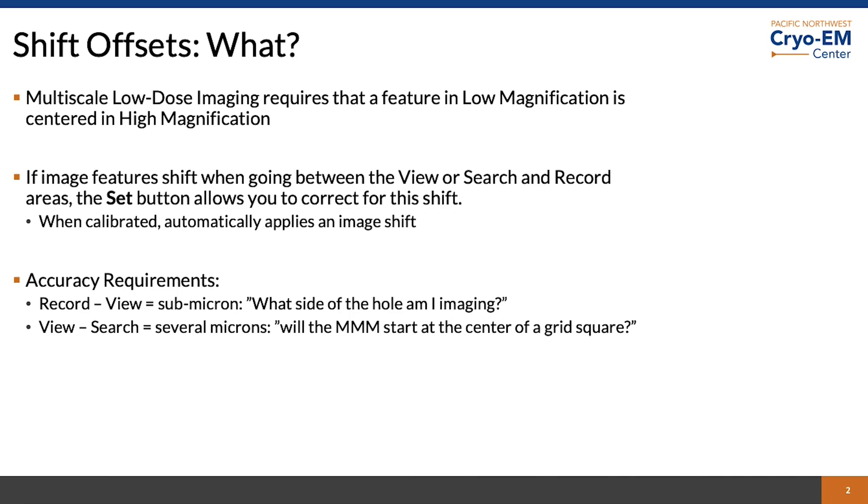For search view, the accuracy requirement is just the correct side of a grid square. If you queue up your medium mag montages by adding points to the low magnification montage, if the view to search offset is incorrect, you may start your maps from a corner and then may not have complete maps of your grid squares. So it's important to check both of these.